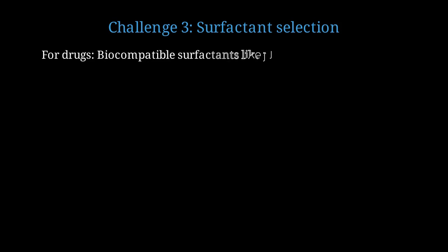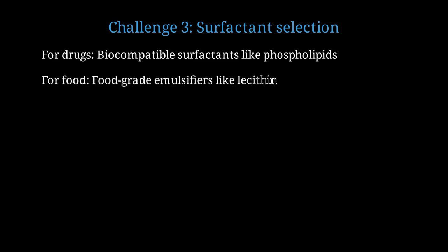The third challenge is selecting the right surfactant. You need a surfactant that stabilizes the droplets, but is also compatible with your application. For drug delivery, you need biocompatible surfactants like phospholipids or pegylated lipids. For food applications, you need food-grade emulsifiers like lecithin or proteins.